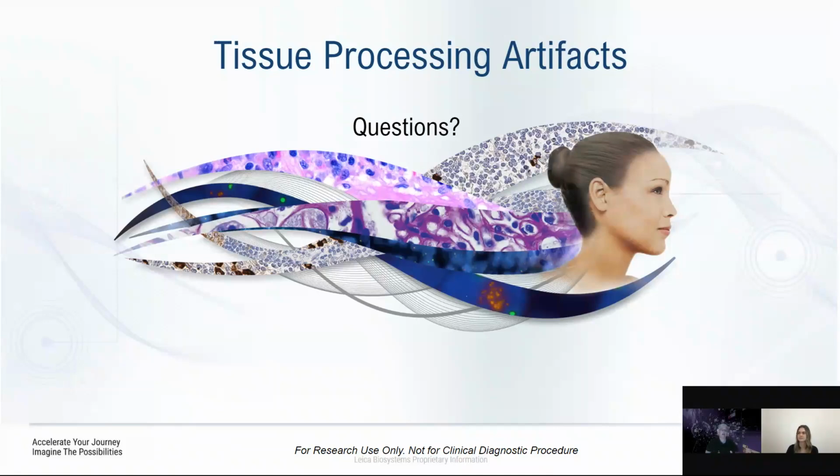So keep in mind as quickly as possible, when you do whole organs, be sure, as you know, kidney and liver have this pseudo kind of capsule. Prostate has it, uterus, right? Anything that's going to be large where solution has to perfuse. If you're not going to use the perfusion tubing, you definitely want to make your sections, cut through that, or just nick the serosa so the solution can rapidly get in and do its job.